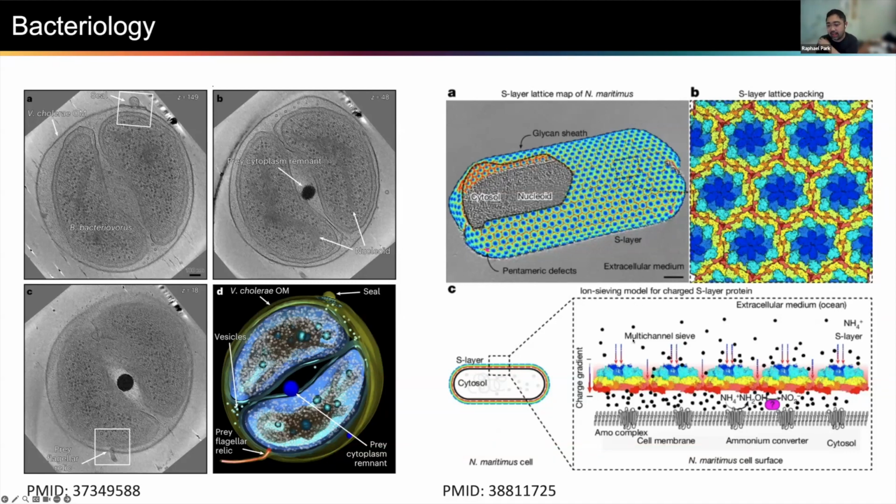Very recently, we also have a paper talking about a bacteria and how they have a non-membrane associated channel that transports things outside of the bacteria. So this is another example of interesting biology, or bacteriology, you can go after using this technology.